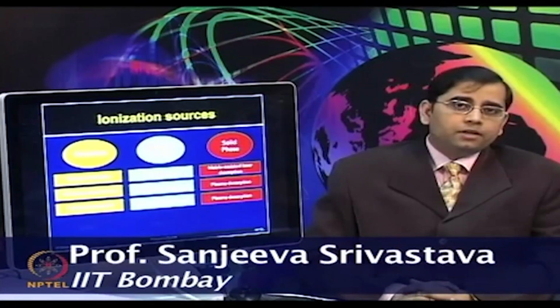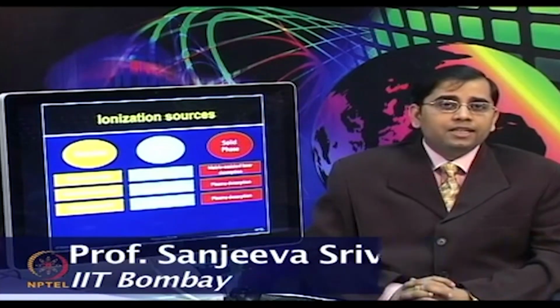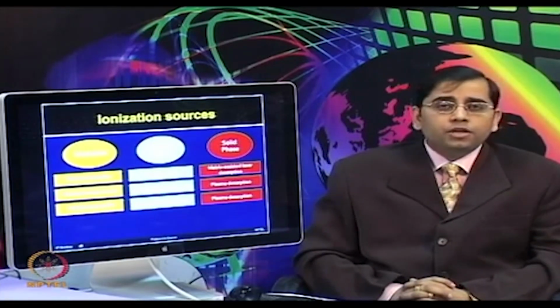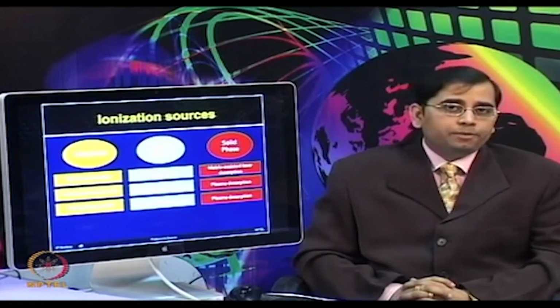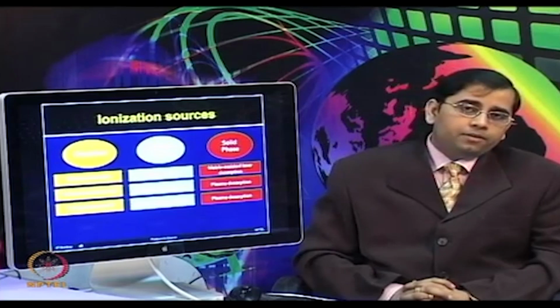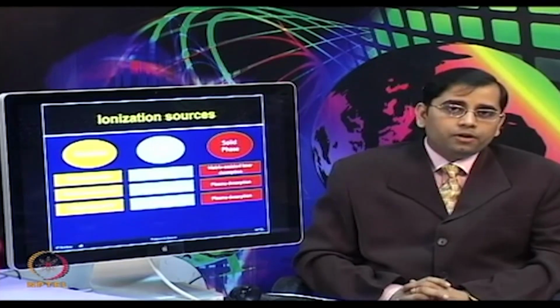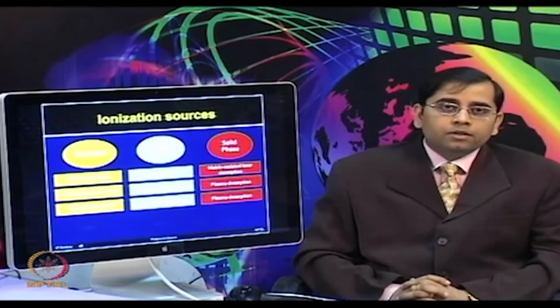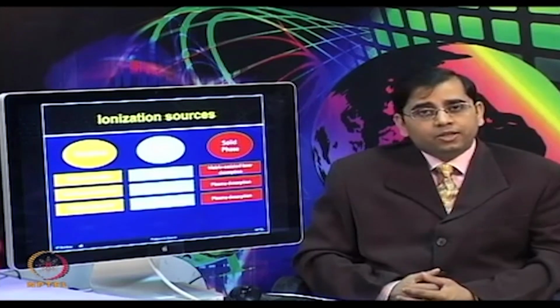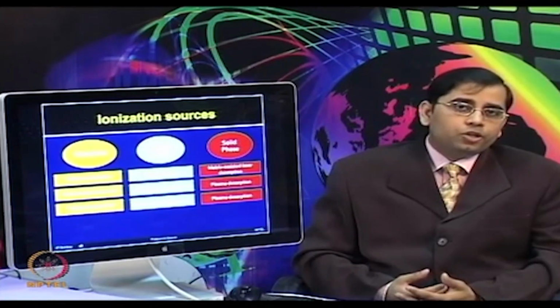So, what are the different types of ionization sources involved in MS analysis? The success of a mass spectrometry experiment lies in the efficiency of converting a neutral compound to a gas phase ionic species. So, you have various types of options currently available. You can select what type of ionization source you want for your specific application. The choice of a particular ionization source is dictated largely by the nature of the sample which one wants to investigate.